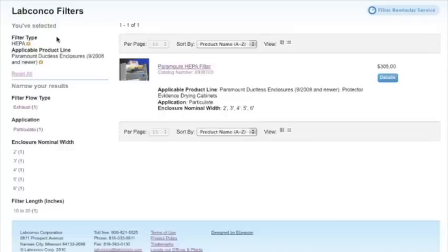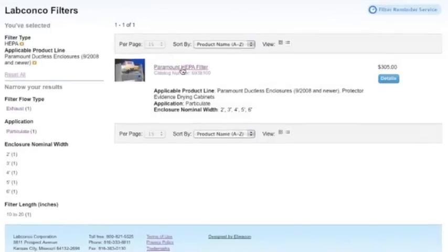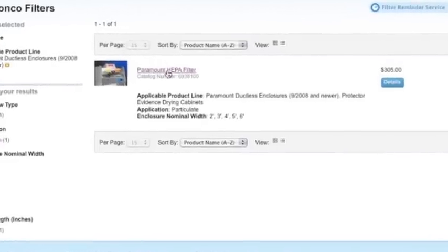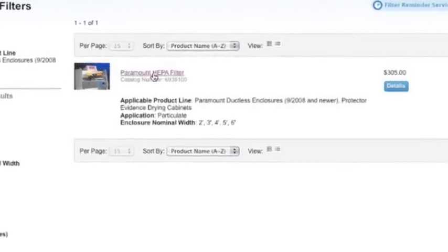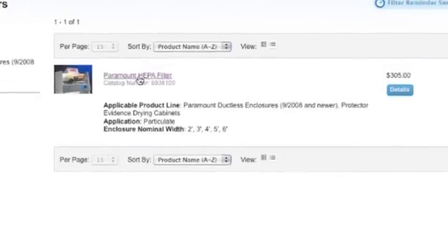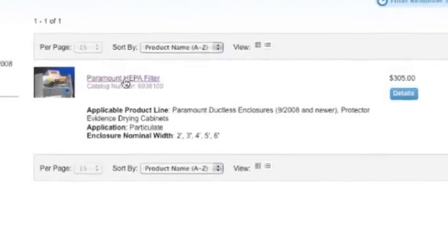In just two steps, the correct filter has been found. Details and purchasing information can be found by clicking on the filter name or the blue details button.